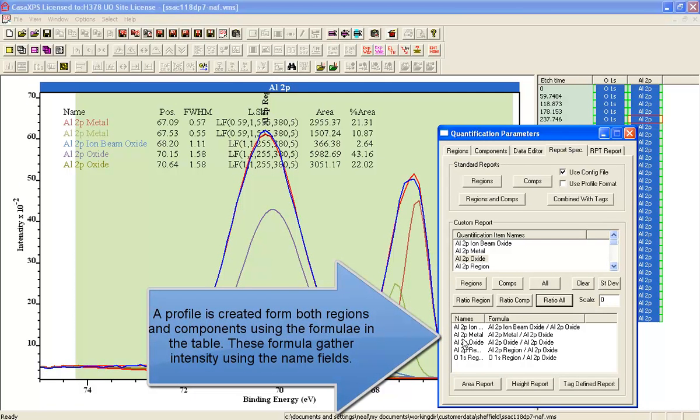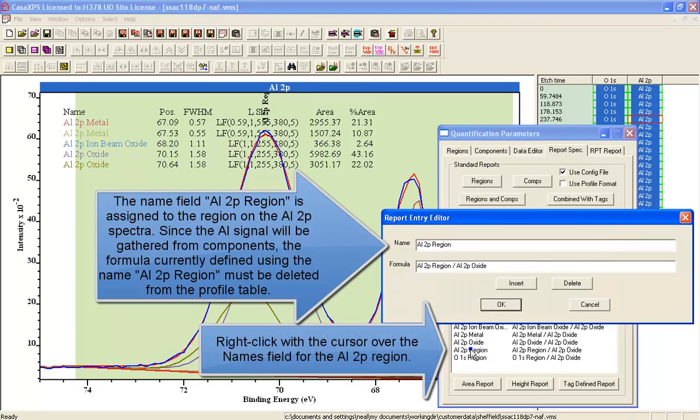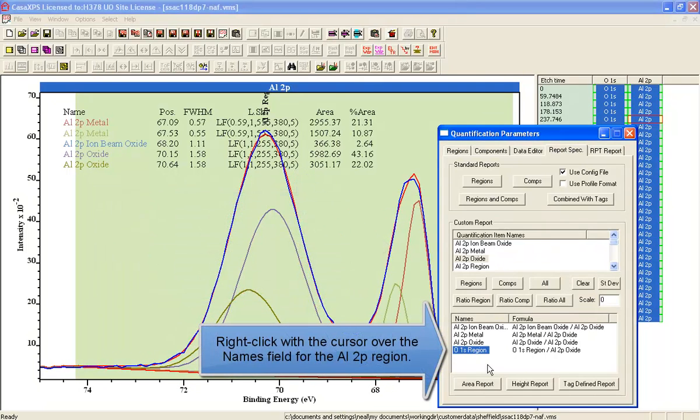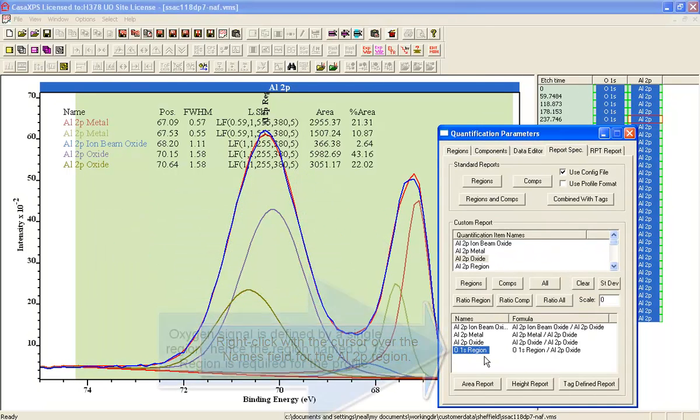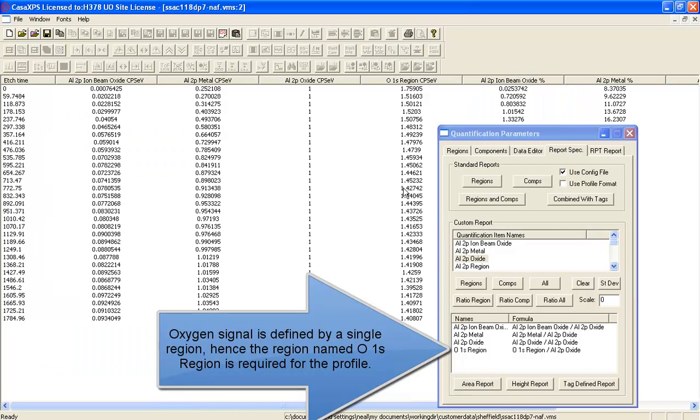Now we've also got in this list that has just been created a region for the Al 2P, but we don't need that, so we'll delete this. The reason we don't need it is because we're going to take the signal from the Al 2P components.